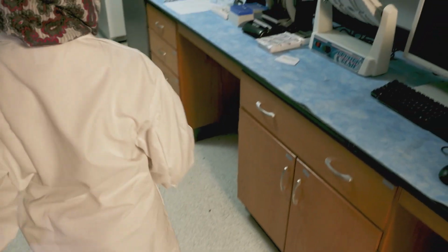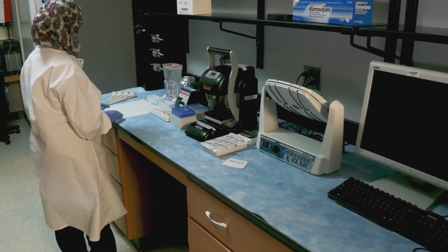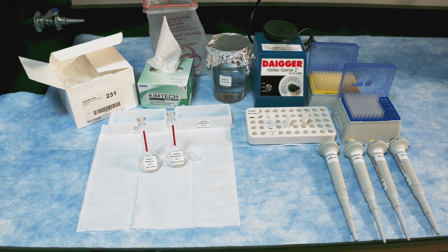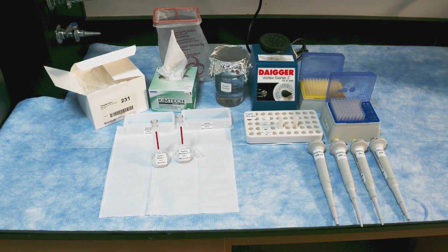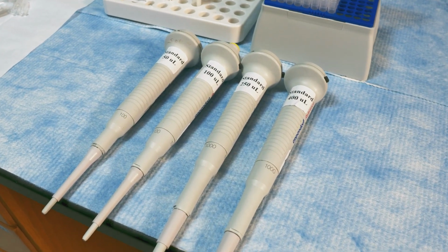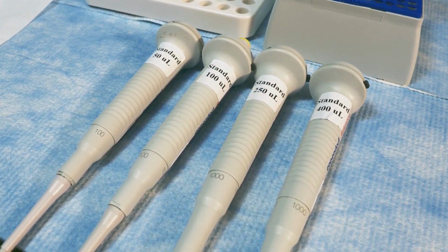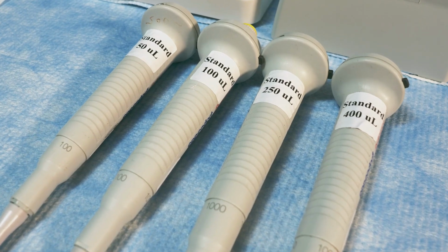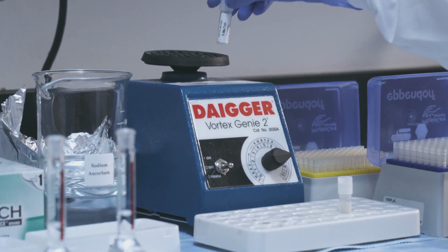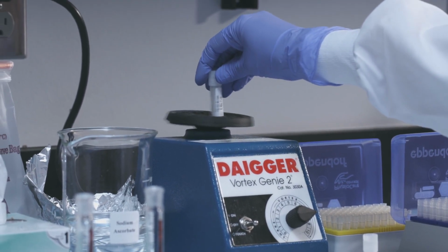Next, work on a different bench to prepare your calibrator working solutions to avoid potential contamination of the bench where you set up the run. We have 4 pipettes that we use exclusively for this purpose. They are set to 50, 100, 250, and 400 microliters. Thaw 1 vial of frozen calibrator stock and mix it well.